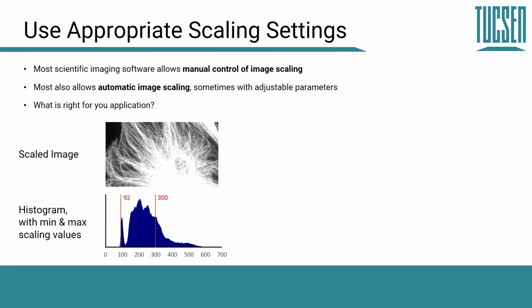As you can see, we have a maximum intensity of something in the region of 580. That's the brightest pixel of the image. But then the modal intensity value, the value with the most pixels containing it, is something in the region of 220, somewhere around there. The darkest pixel is something around 85 or 90.